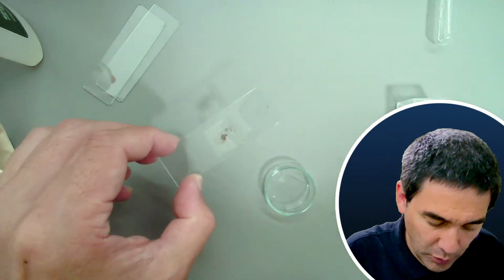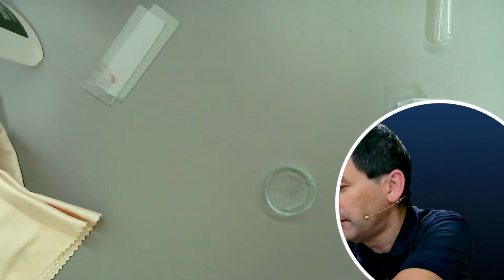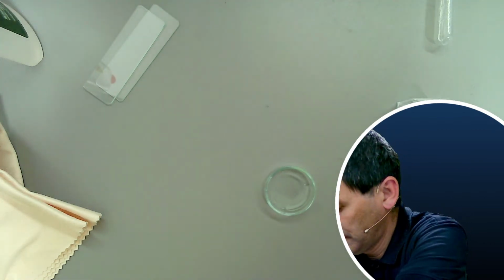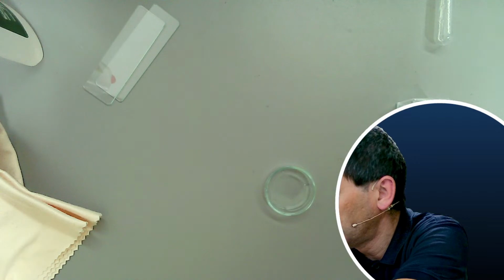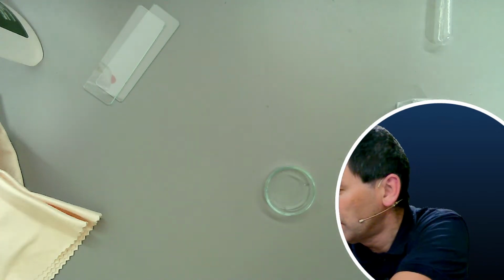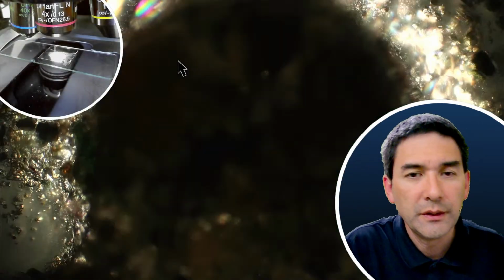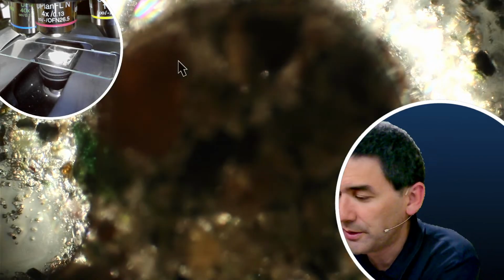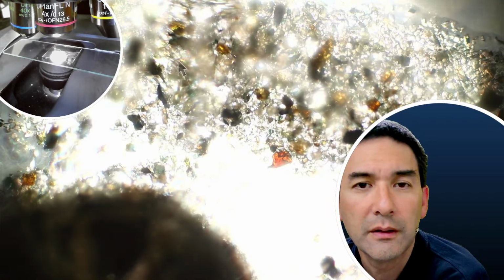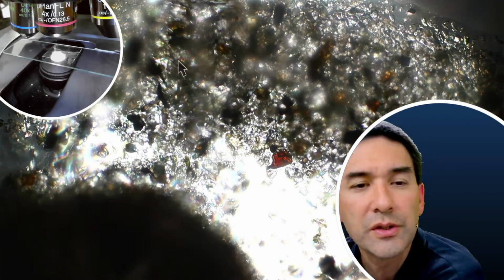It's just enough to hold the cover glass a little bit. Okay, let's give this one a try. I need to change the microscope to the microscope view. That's usually always the problem when there are too many. And let's close this a little bit.